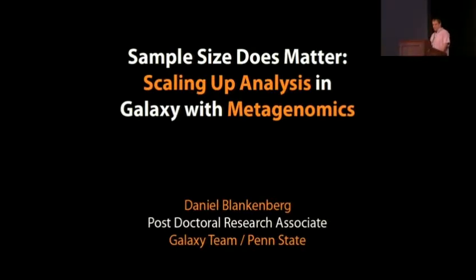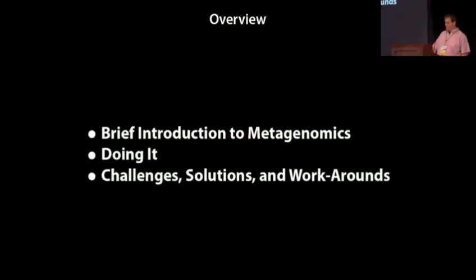I'll be talking about scaling up analysis inside of Galaxy, using metagenomics as a perfect example for this. First I'll give a brief introduction to what metagenomics is. Then I'll step through an example of actually doing it. Then I'll highlight some challenges, some solutions, and some workarounds that I encountered.